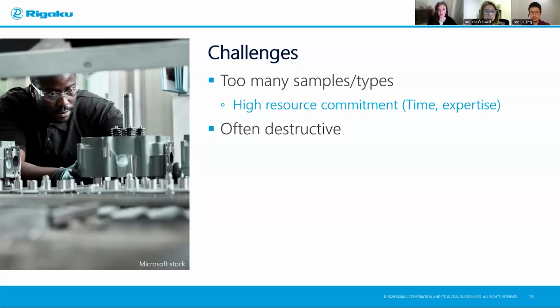So now it brings more information that you have to consider before you can make conclusions. Like, okay, is there sampling bias? Did I cause the thing to break, or was it already broken when I cracked it open? And because it's destructive, you do one examination, maybe you have to do another one for another, and both are destructive. You have to make more samples. That loops back to the first point that, okay, you need more and more sample types.